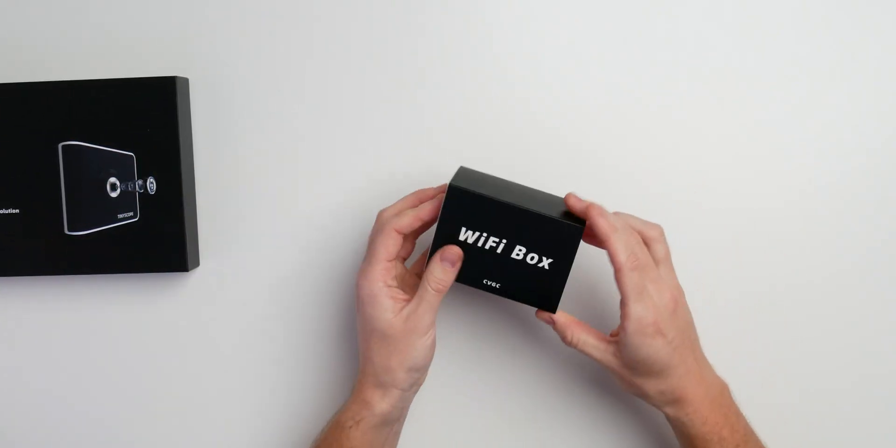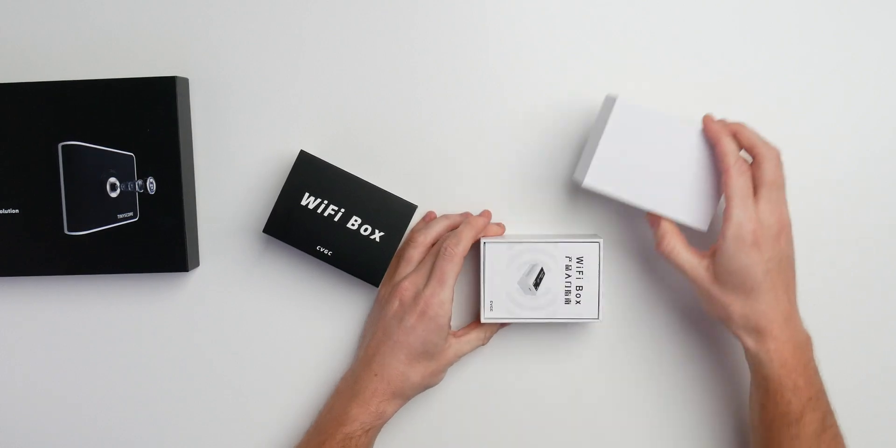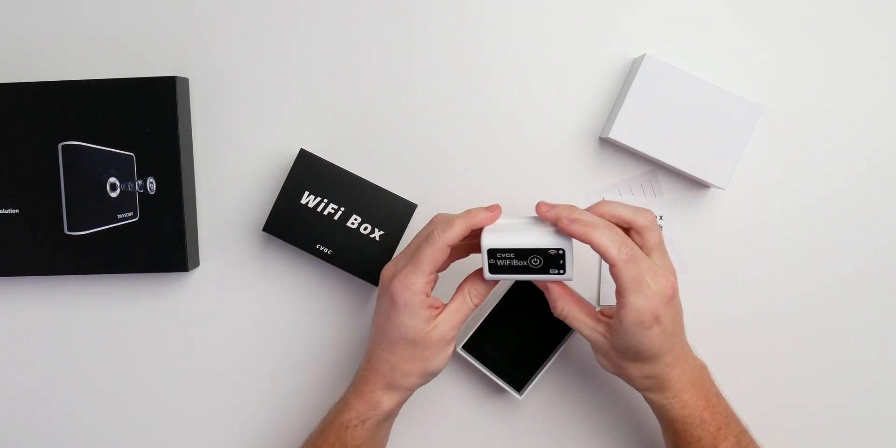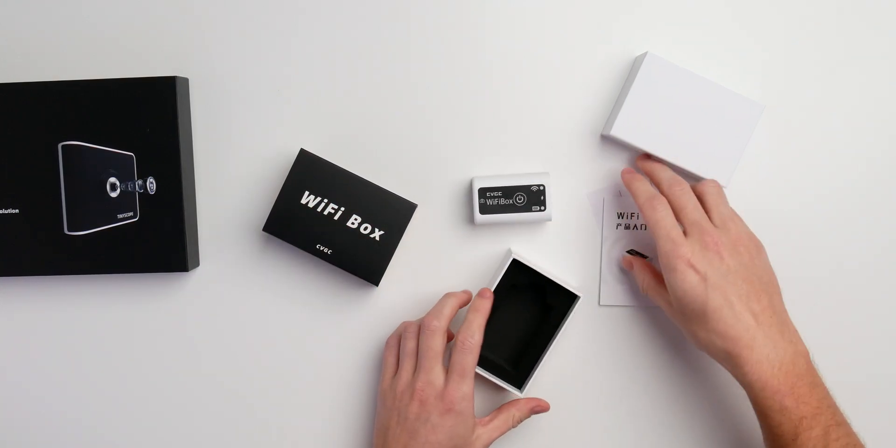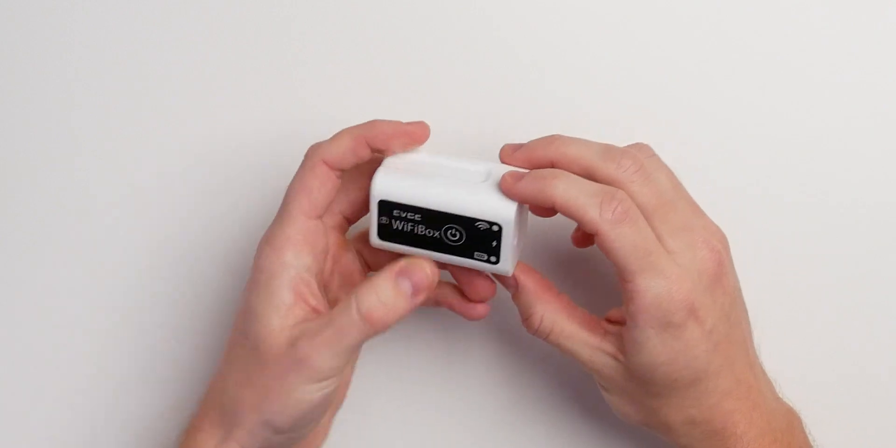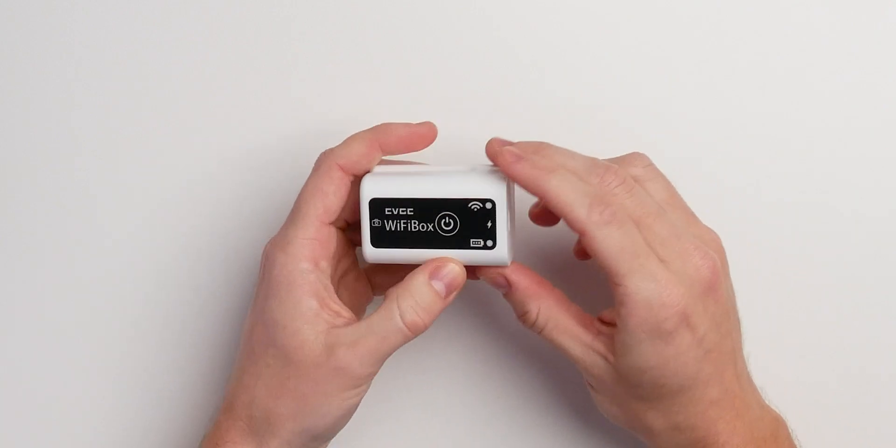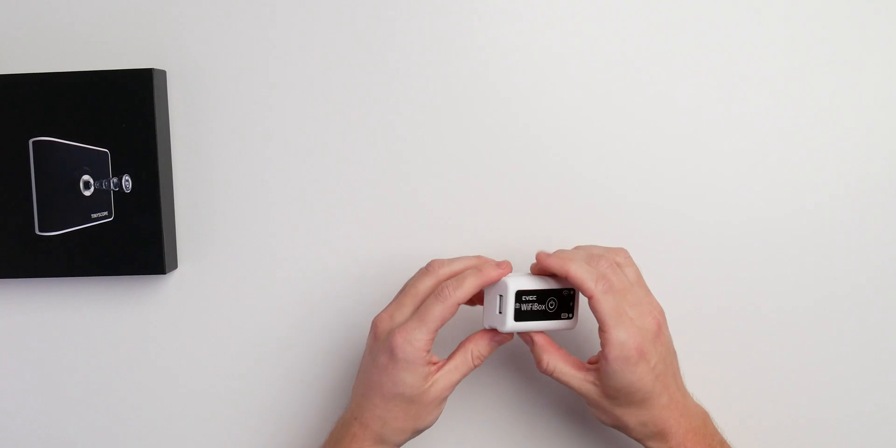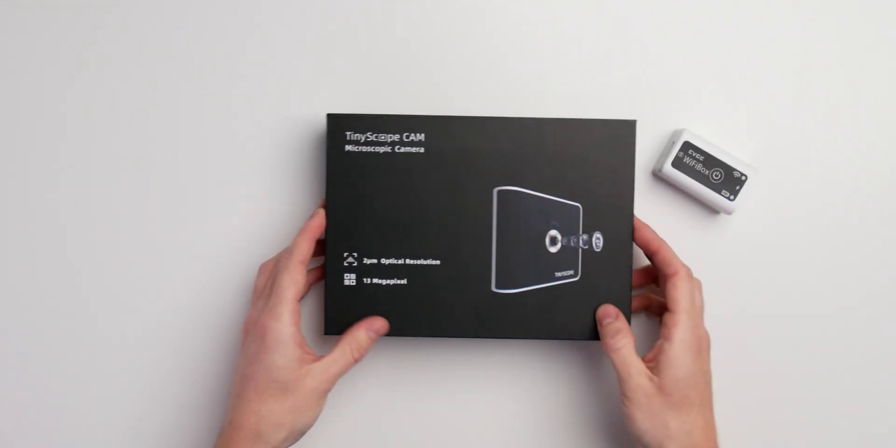That means just first start with the pretty easy part here. The WiFi box, nothing special, paperwork here and you just get this little box. It's relatively light to be honest. Nothing really special and that's just the complete magic of this WiFi box. You can just turn it on, turn it off. On the one side you get USB Type-A, on the other side you get USB Type-C which is pretty cool. It could have gone for micro USB but USB Type-C everything and I really like the idea. Relatively light even though the battery is inside of it here. So you can charge it, power it up with USB Type-C on this side. And the other side is just used for this OTG mode I'm just talking about in a minute and we'll just take a deeper look inside of it.